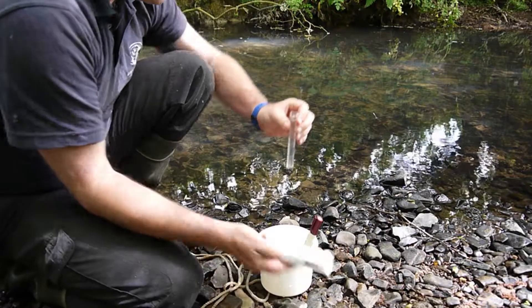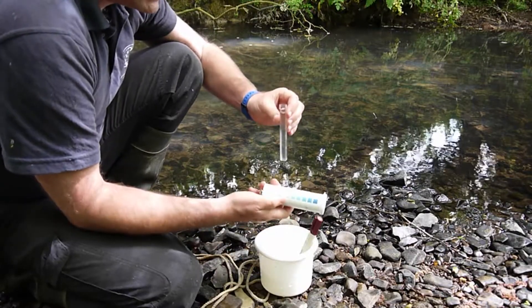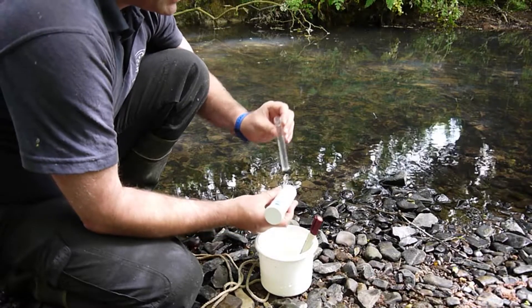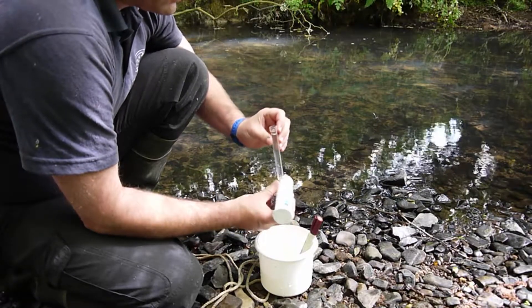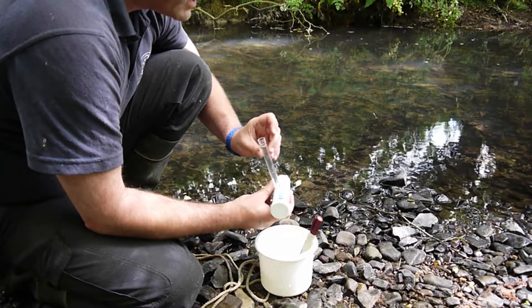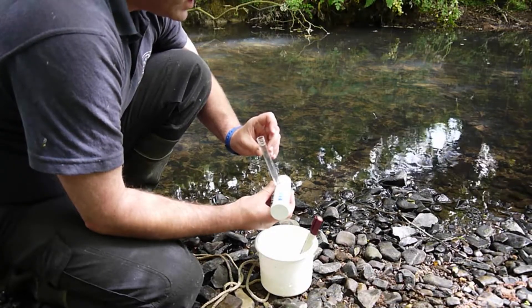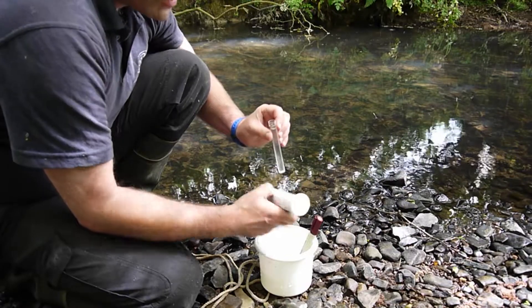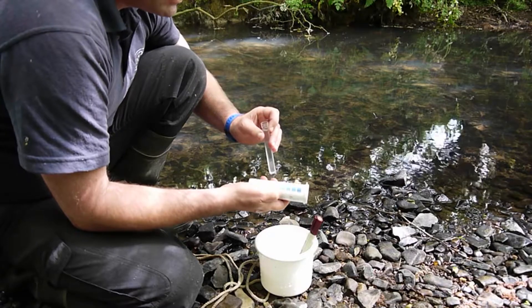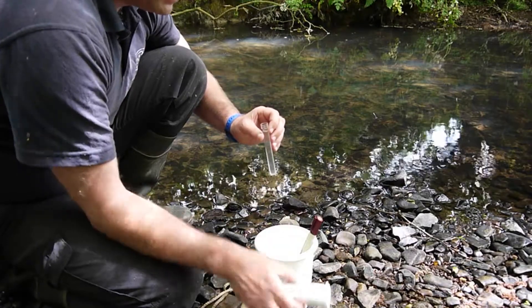Now we're going to look for a colour change in the tube against the colour squares on the pot. Pop the square end of the tube onto the white squares next to each blue square and check which colour it's nearest to. This one is right down to zero — there's no blue in there at all. If it does sit partway between two values, go for the lower one.